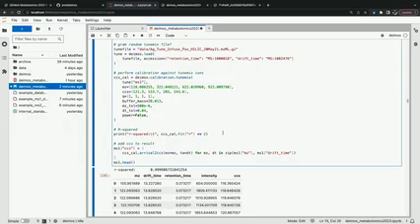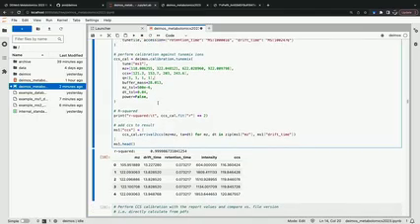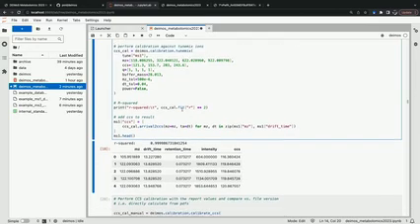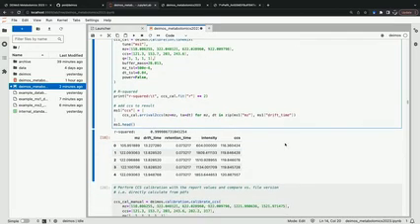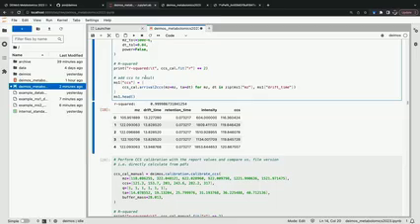This is just from the Agilent tune mix. Specify the buffer mass, here it's nitrogen gas, and include a tolerance in each dimension where it'll search. DEIMoS will search for those tune mix ion peaks and then perform the calibration. And you can see the results from that calibration are here. The R squared is very high, and then you can calibrate the CCS for your data based on the results from this calibration.